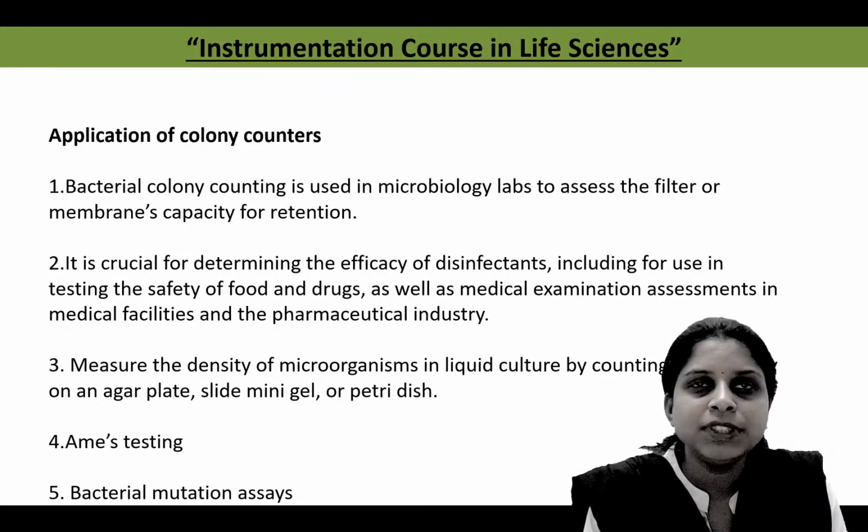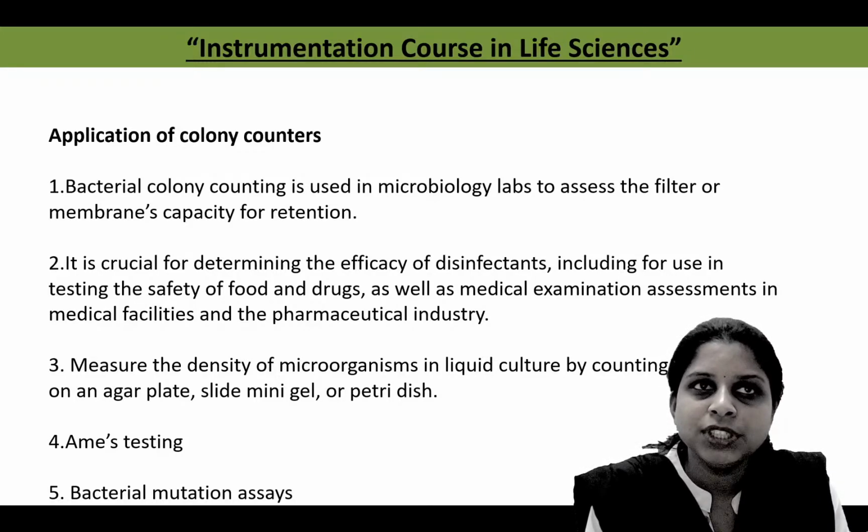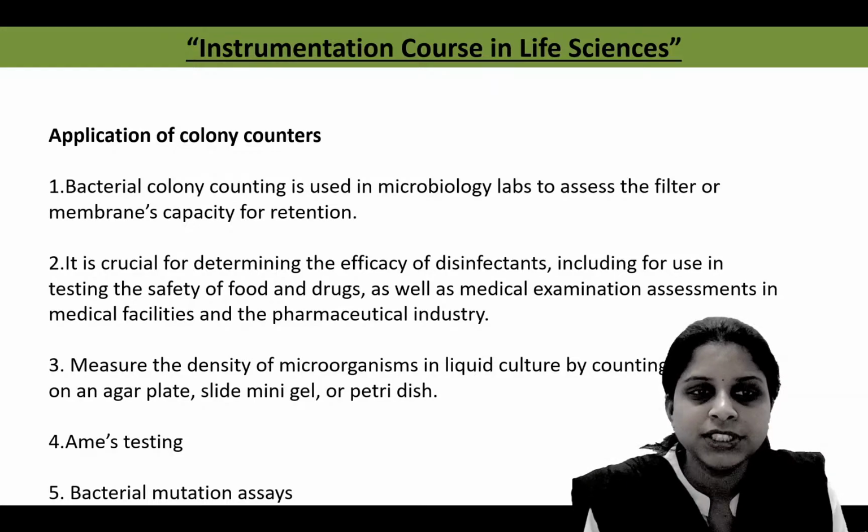It is used in AMES testing. The AMES test is carried out to determine the carcinogenicity of any chemical. And last, it is used in bacterial mutation assays.